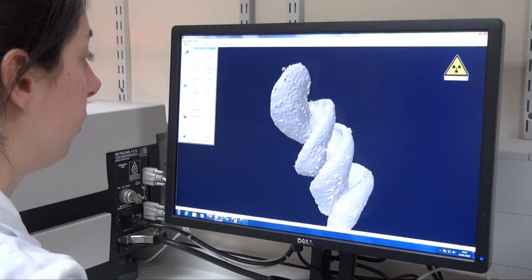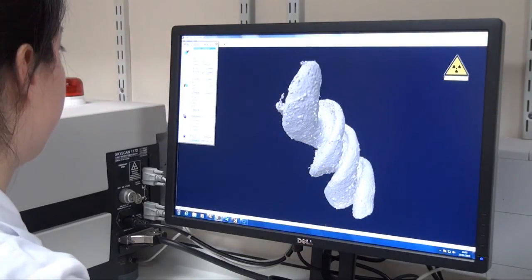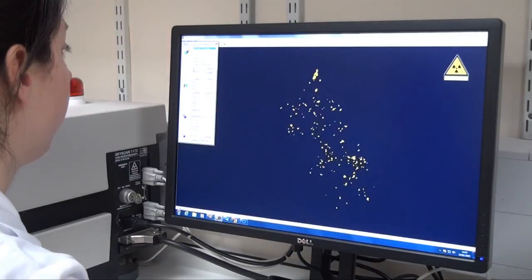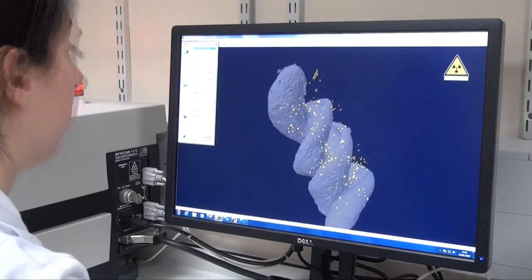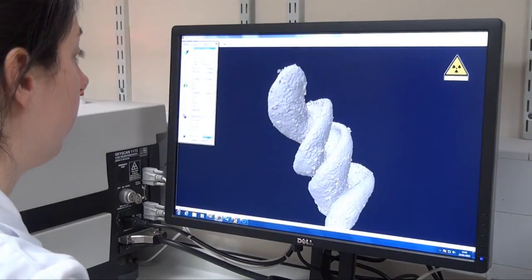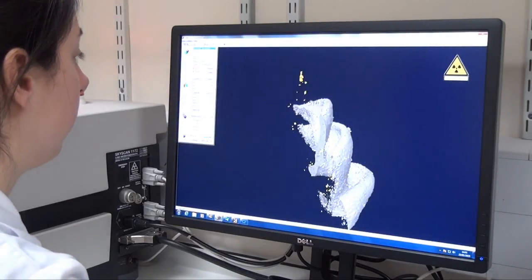Components with differing density can be separately identified. Here, the position of salt seasoning in a snack product can be clearly seen. This illustrates the potential for exploring the relationship between product structure and quality in fine detail.